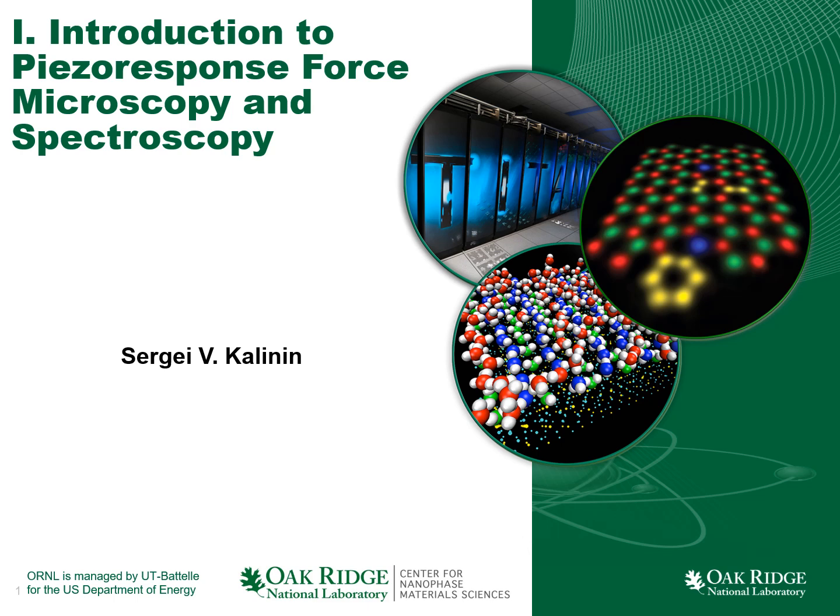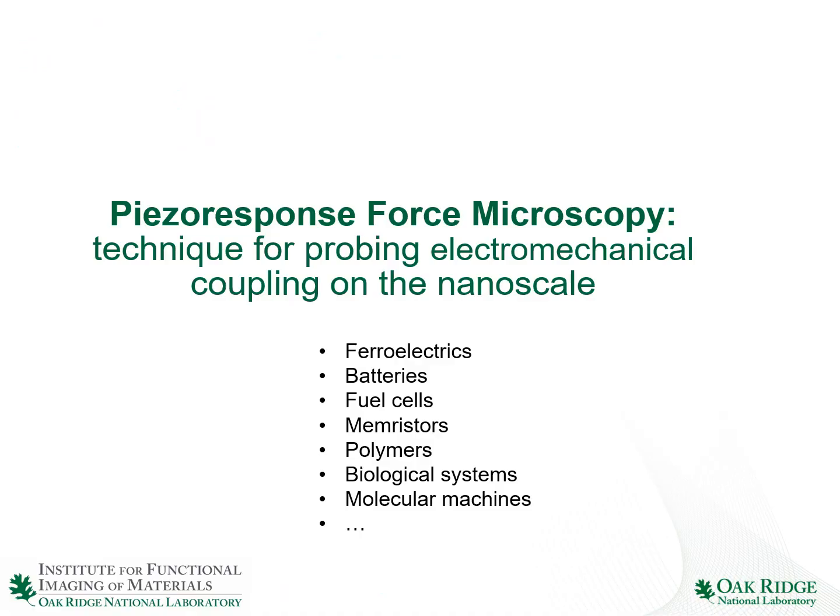This introductory lecture opens the set of lectures on the principles and applications of piezoresponse force microscopy and spectroscopy. In brief, piezoresponse force microscopy is the technique for probing electromechanical coupling on the nanometer scale. And it is incredibly useful for studying materials such as ferroelectrics, batteries, fuel cells, memristors, polymers, biological systems, and maybe coming applications such as molecular machines and many others.